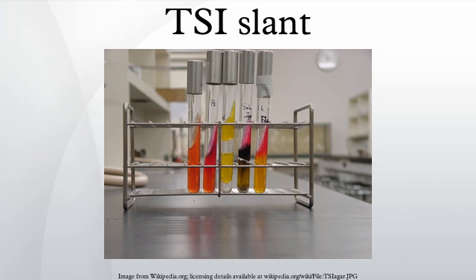TSI agar medium was developed based on Kligler's iron agar, which had been used for the determination of lactose fermentative bacteria, by addition of sucrose to be able to detect sucrose fermentative bacteria also.